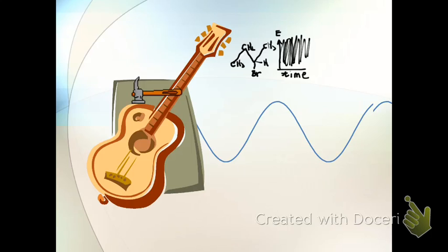We're recording the signals for all of these different vibrations that are going on at the same time once the molecule has been struck. If you know how a guitar works, each of the strings is tuned to a particular note. If you hit a guitar like that, it makes a horrible noise at first, but if you listen closely, eventually what you get is the signal for all 6 strings coming out at the same time.